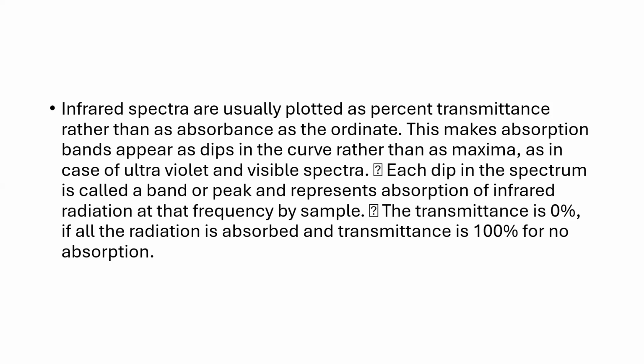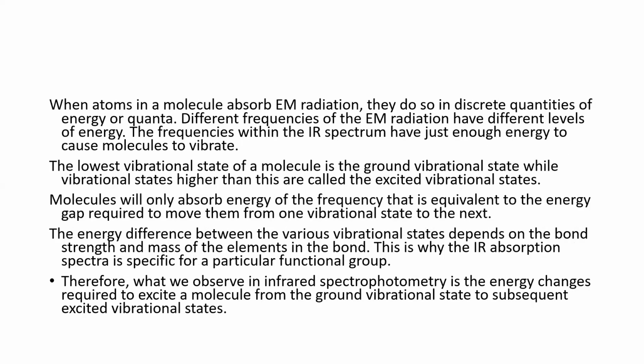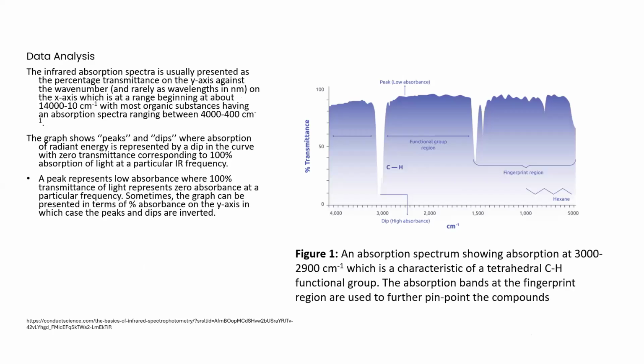All right. And the spectrum, like lambda max we calculate in UV visible, here the spectrum band or a peak will represent the absorption of infrared radiation. How it looks, we will see. These are the theoretical details, I'll just skip. I'll come on to the schematic diagram. Now here, if you are able to see, you can see the range 4,000, 3,000, 2,000, like that, right?